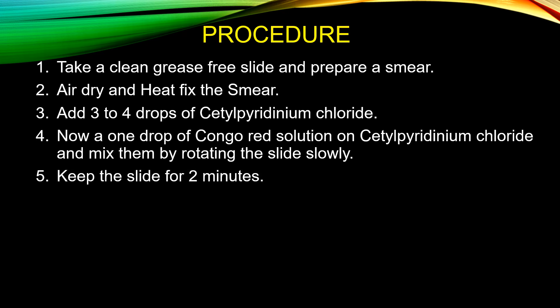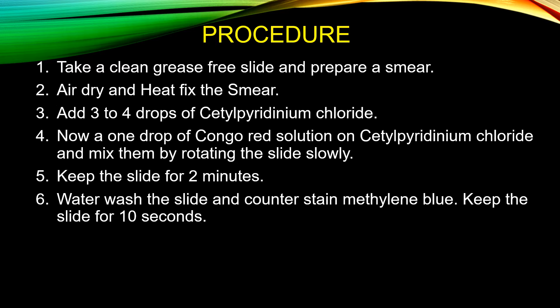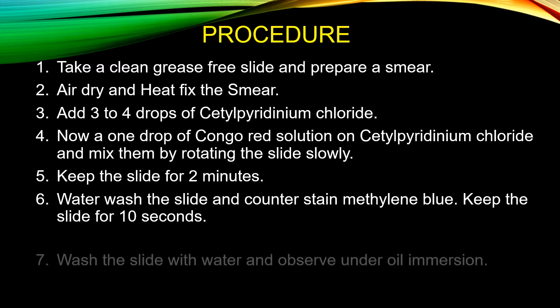Further, keep the slide for 2 minutes. Then water wash the slide and add the counter stain, that is methylene blue, and keep the slide for 10 seconds.